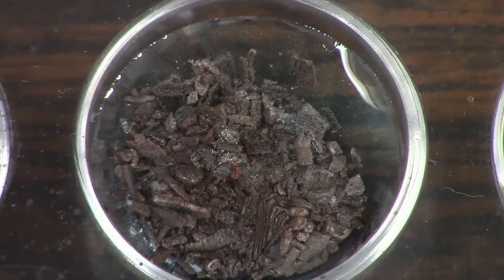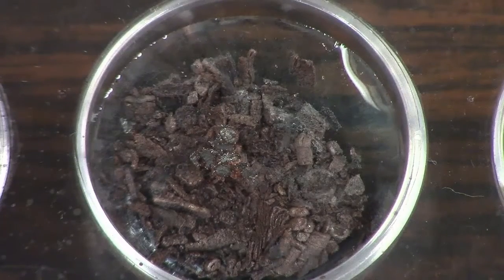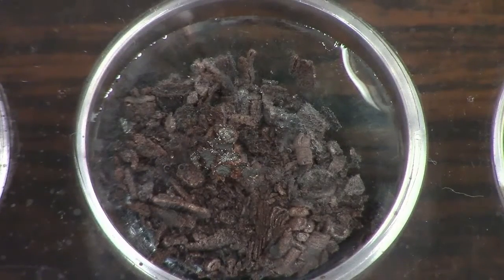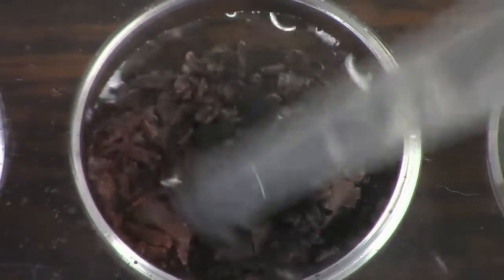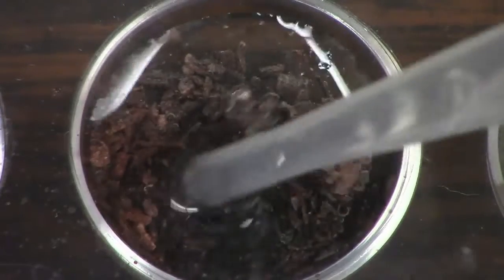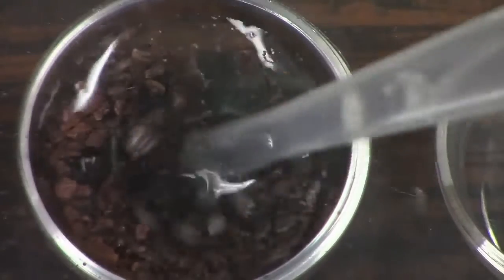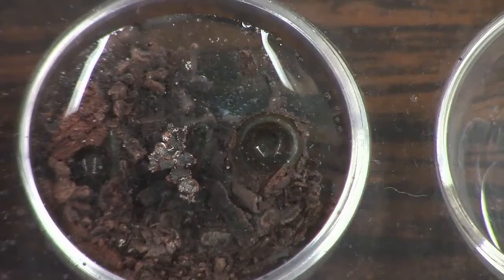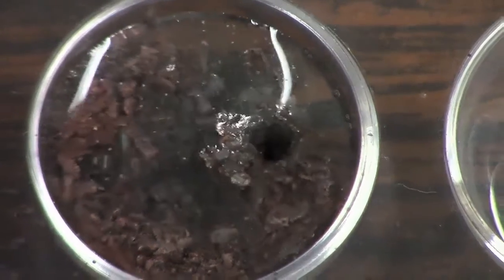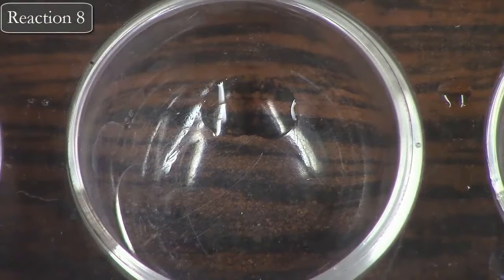Right, based on those observations, try to predict what products might have been formed. Right there, they're just trying to make sure everything is nice and combined, right? That's where you really can see evidence of chemical change.